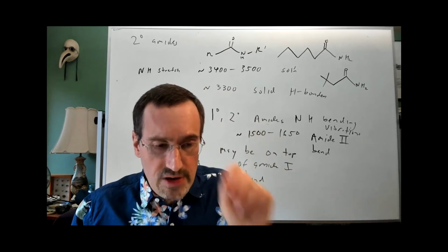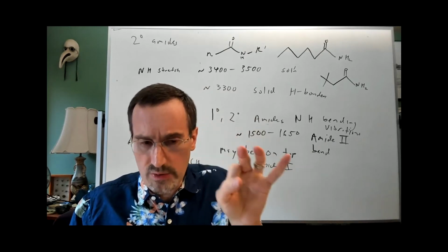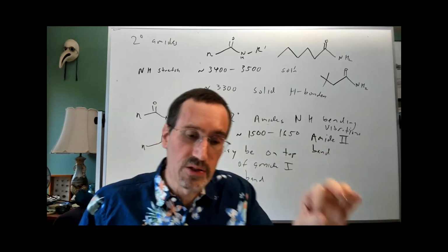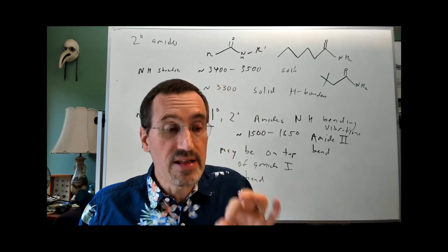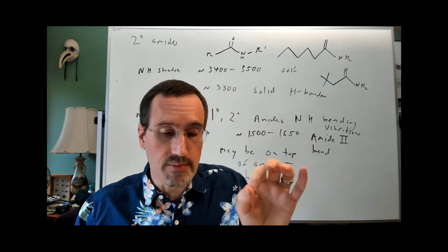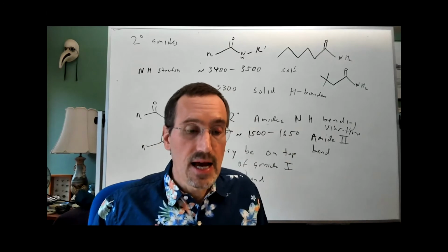Grind them very fine so that the granularity of your solid is smaller than the wavelength of light. In other words, your particles are a fraction of a micron in size, or at least just a micron or 2 microns in size.